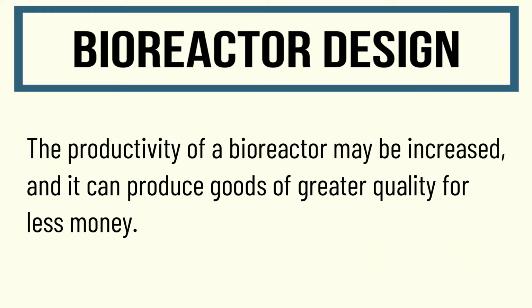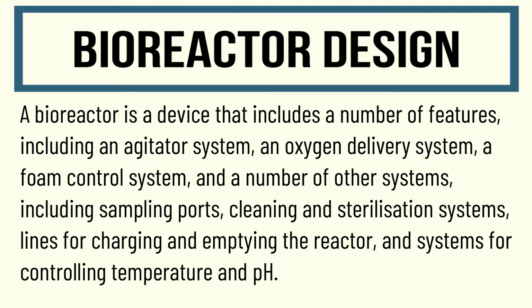A bioreactor is a device that includes a number of features including an agitator system, an oxygen delivery system, a foam control system, and a number of other systems including sampling ports, cleaning and sterilization systems, lines for charging and emptying the reactor, and systems for controlling temperature and pH.